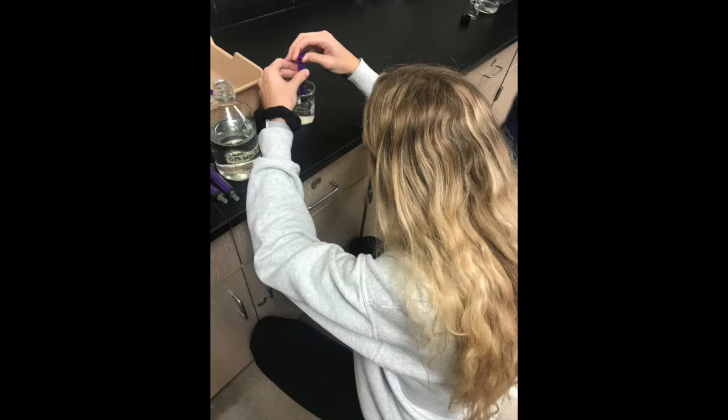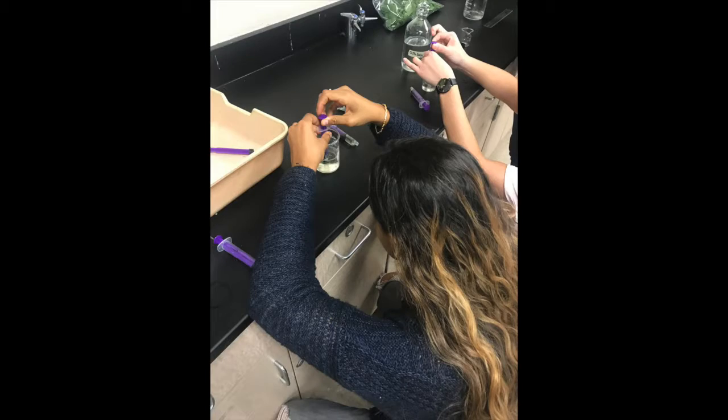Next, place the leaves in 3 different syringes and fill those syringes with 5 milliliters of sodium bicarbonate and soap solution. To reduce surface tension, create a vacuum by pulling the syringe and covering the top with your finger and swirl. Repeat until all 10 discs in each syringe sink.